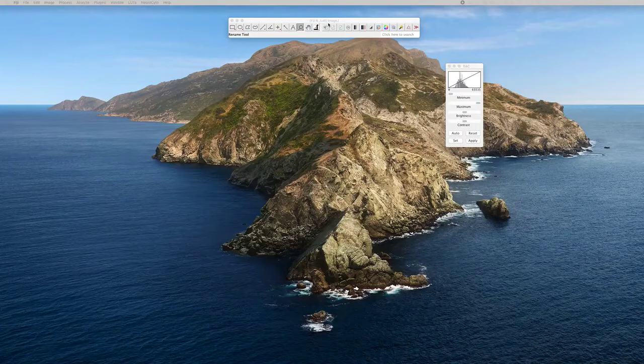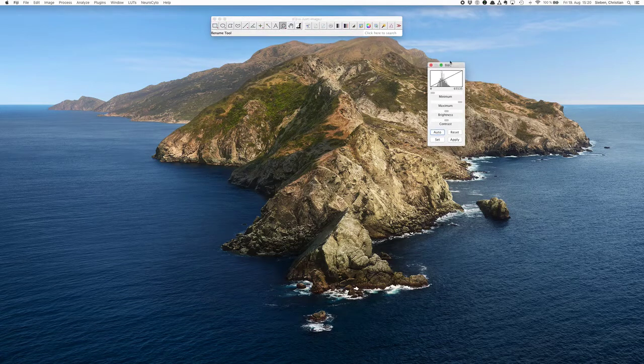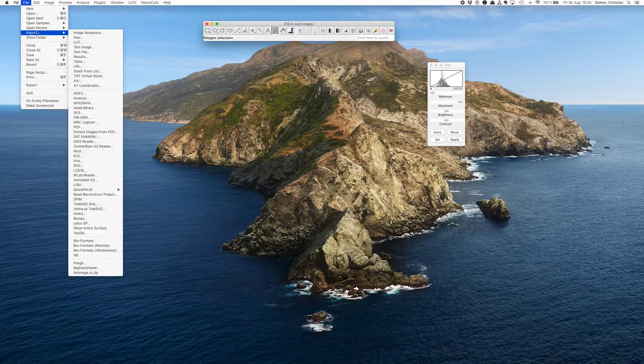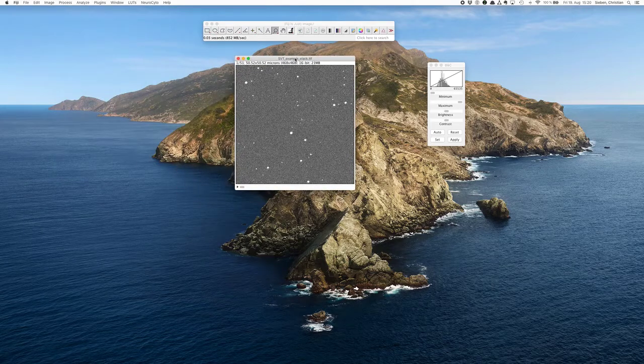I would like to show you how to track individual particles using Trackmate. Trackmate is a Fiji plugin. So we open up Fiji and we import our TIFF stack, which I have here in the recent history. This is my TIFF stack, which is from a spinning disk confocal, fluorescent particles moving around.